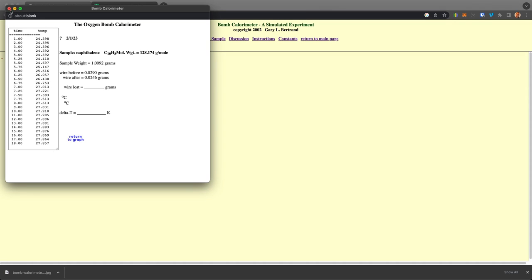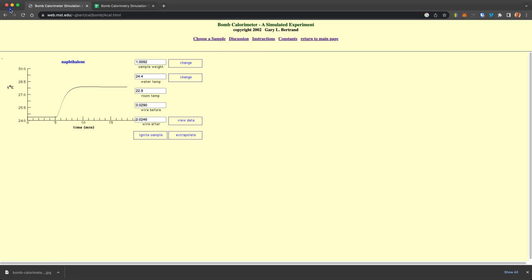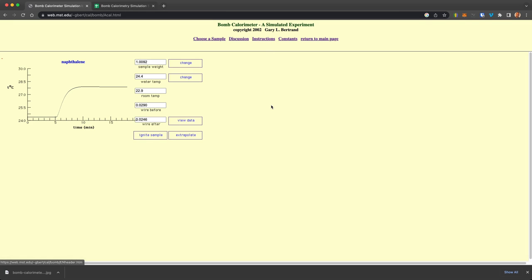So this is very realistic, both in a time perspective, the weights of the samples, and most parameters. And these are discussed in here that it is using 30 atmospheres of oxygen, 2 liters of water. These are all very common parameters used in experimental apparatus.